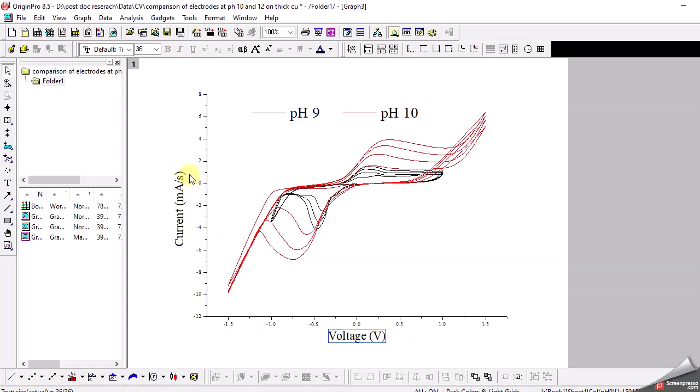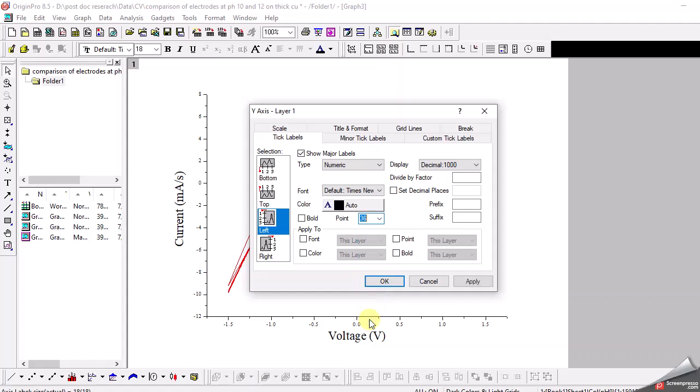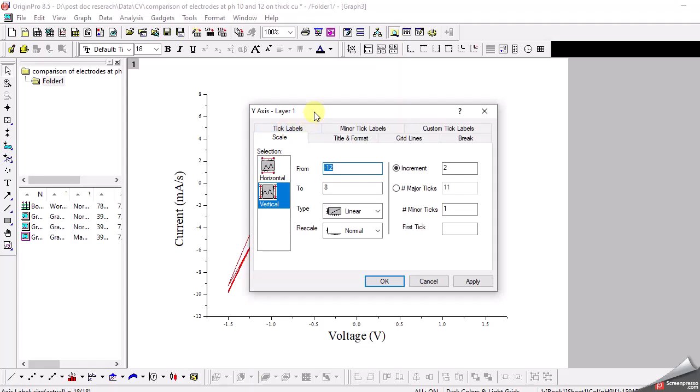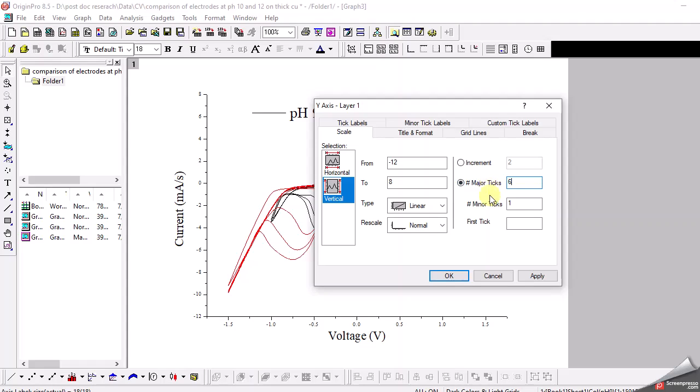Now I need to format the y-axis. As you can see, this is not legible and there are too many ticks. I double click it, first increase the size to 36, then click on the scale. There's an option for major ticks - it's 11 right now, which means there are 11 ticks on the y-axis which is too much. I just want it to be 6, apply it, and it looks quite good.